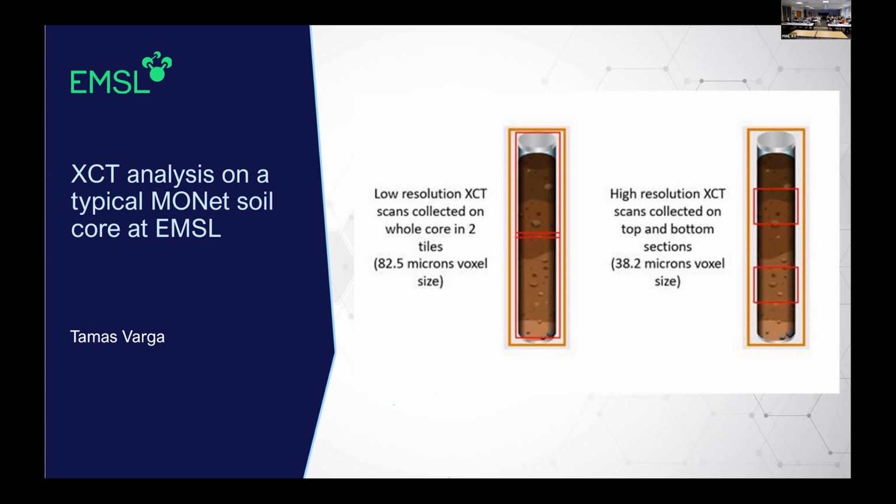Yes. This is perhaps related to the Geoderma paper, but do these analyses have to happen at room temperature, or were you able to do those soils while frozen? They don't have to happen at room temperature. We image at room temperature just because we don't have a well-developed capability to keep the cores at constant temperature.